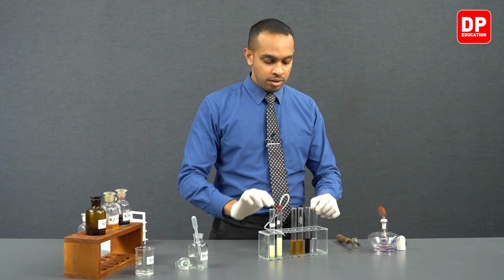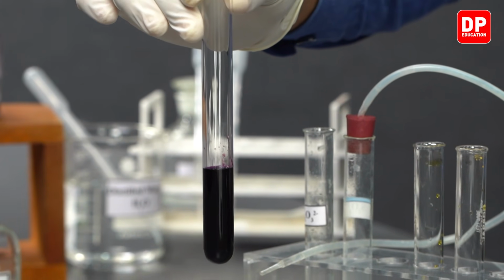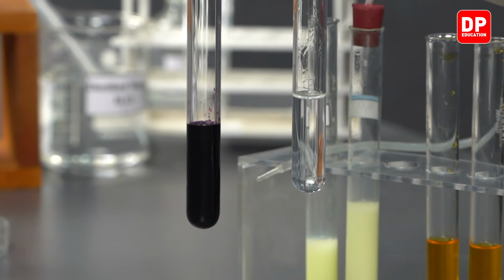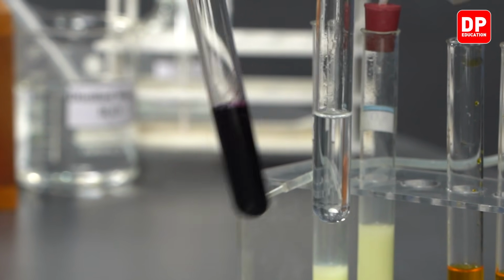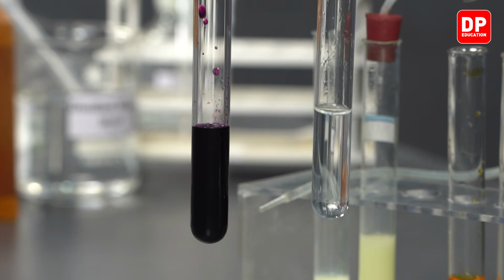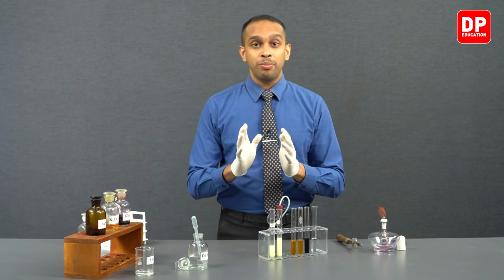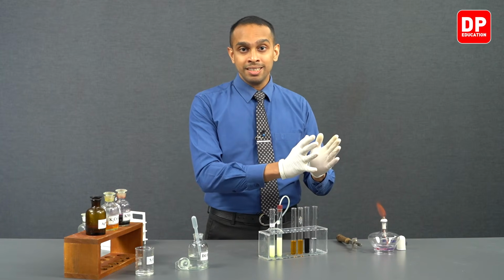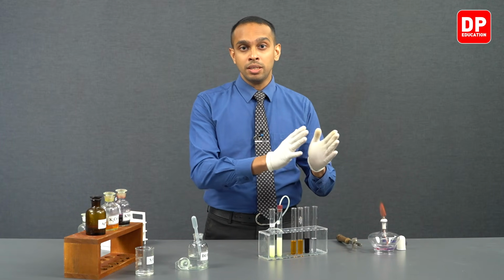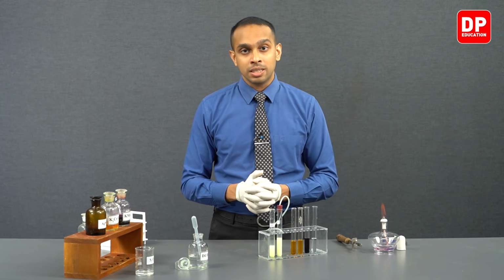If you observe the color of the potassium permanganate before we sent sulfur dioxide through it and after, you can clearly observe that the purple color has completely disappeared because it has gotten reduced to form Mn2+. Permanganate ions, which are purple in color, turned into Mn2+, which appear colorless in aqueous medium. And as this happened, sulfur dioxide turned into sulfate ions.